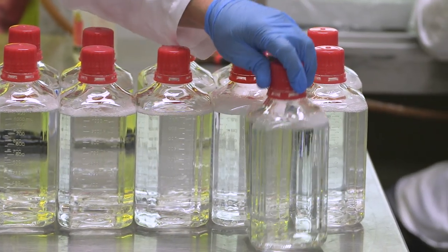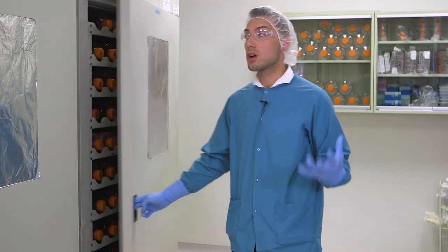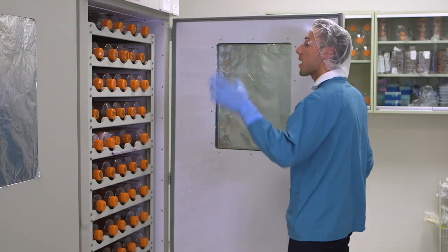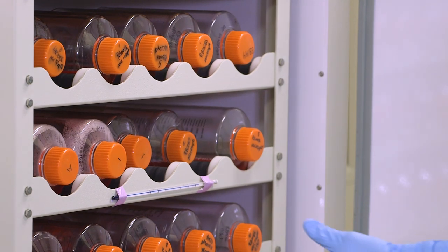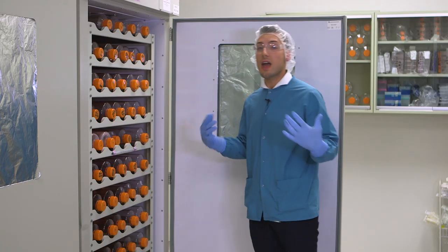Our cell culture team is flexible and we are able to do various amounts of volumes of antibody production growths ranging anywhere from a half liter all the way up to 100 liters plus, specifically for our catalog items like TruBlot which is a monoclonal secondary antibody that we sell.